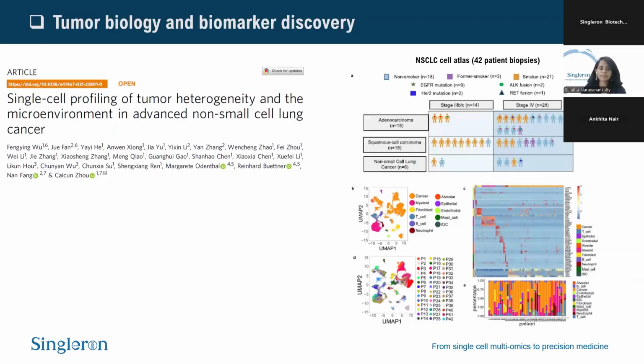For starters, the study has 42 patient samples. These are patients from the different subtypes, adenocarcinoma, squamous cell carcinoma, and others that cannot definitively be identified into either of these subtypes. So you can first build a whole disease atlas based on all of these patients. So you have the different cell types, how their composition changes across the different conditions, etc.